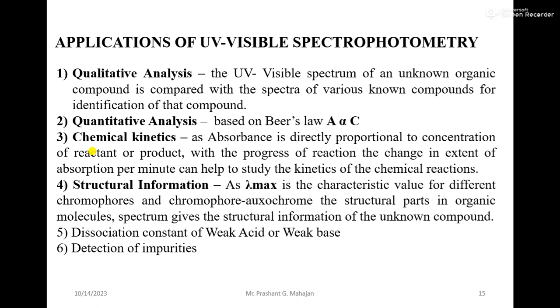Fourth is structural information. Lambda max is a characteristic value of different chromophores and auxochromes. The structural parts in the organic molecule give structural information of the unknown compound.